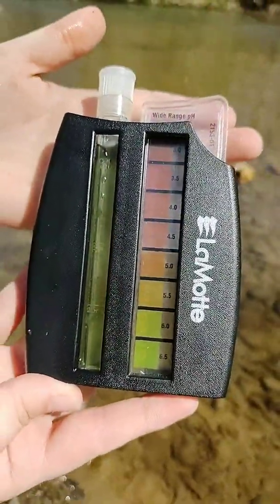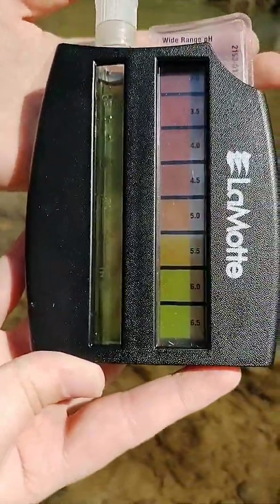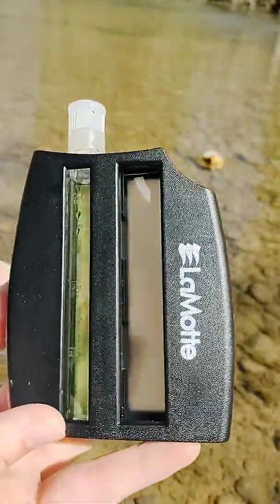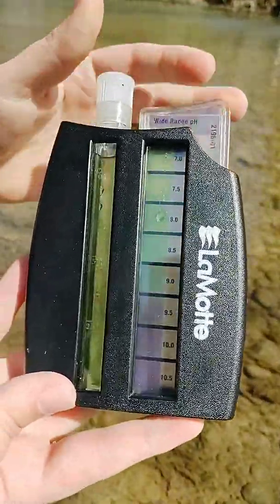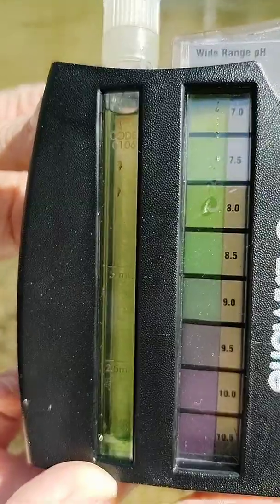Go ahead and take a look at that and see what you think matches the best. Then I'll switch out the other slide, and this next one is going to be 7.0 to 10.5. Go ahead and match those colors and see what you think.